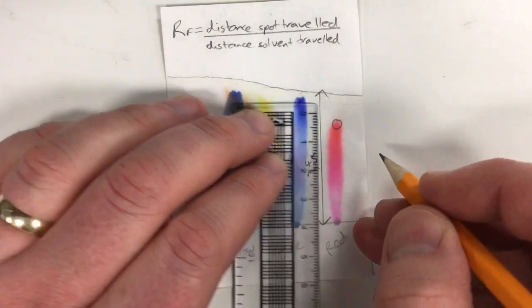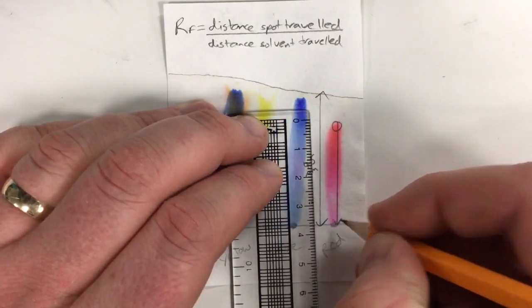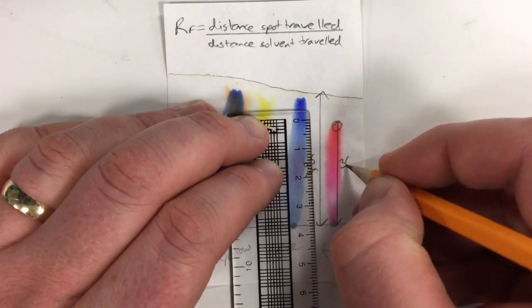These values can be determined using a ruler and measured directly on the chromatogram. For each of the different coloured pigments we take the peak point at which it has risen up the chromatography plate.